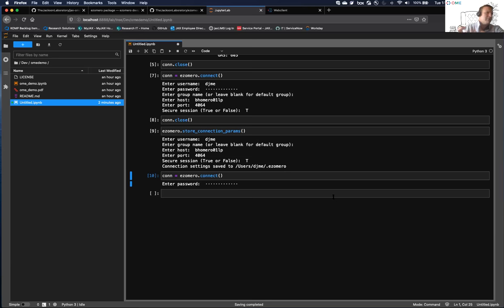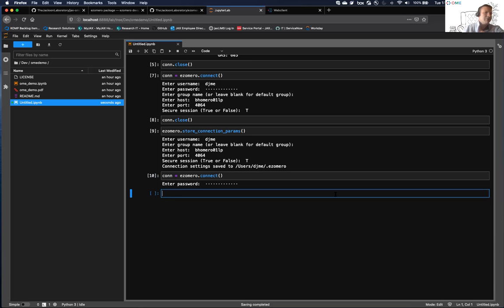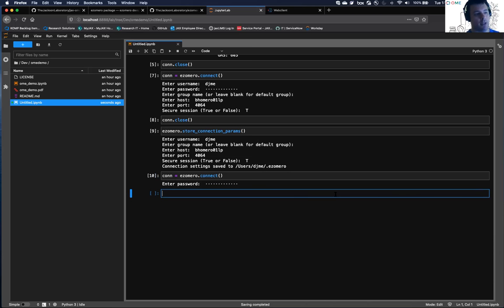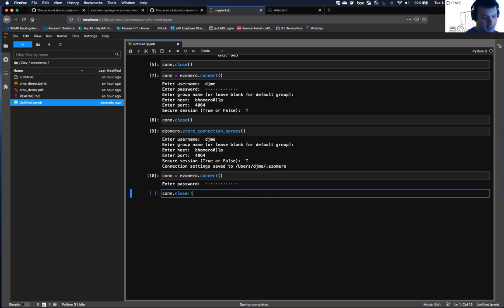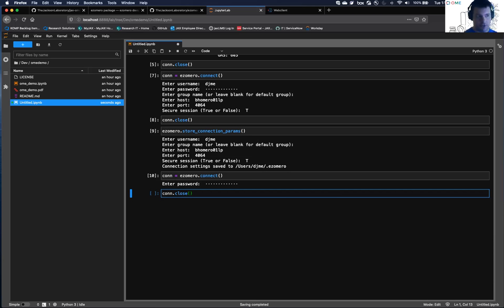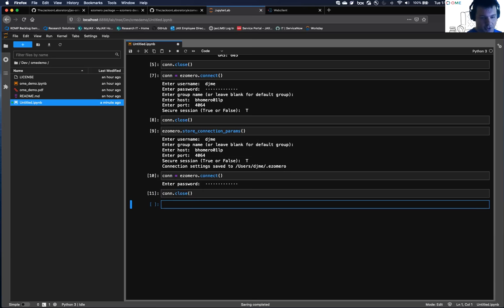If the config file already exists, it'll ask you if you want to replace it. And you can create and point to a separate config file. At the moment, we only consider the easyOmero file as a reference file. So this is something that we kind of just recently made public. If you guys think this sort of thing is cool, I encourage you to drop into the repo, leave issues, feedback, or you can give us feedback here.